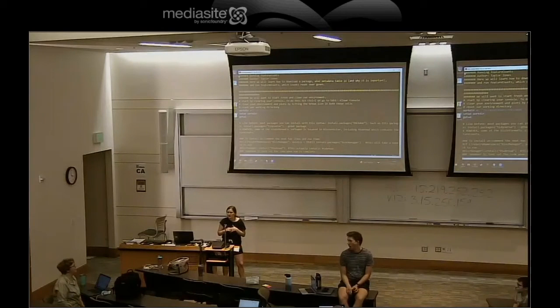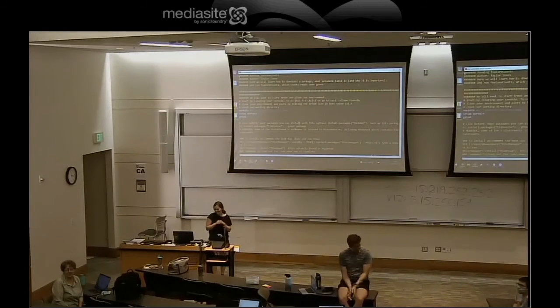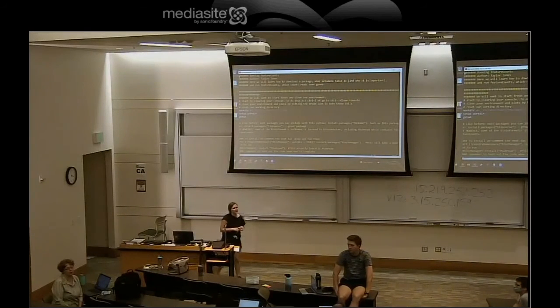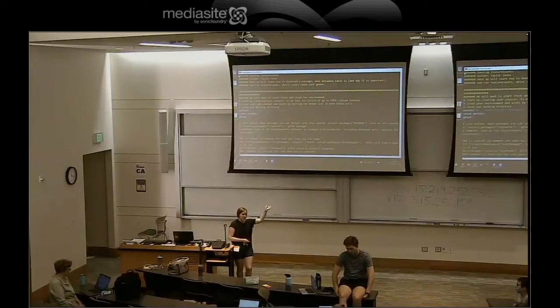There's no package on here right now. Local install is what you did, and if we all local installed on the supercomputer, we'd probably kill it. So instead, we're going to have the IT staff global install it, which means everybody in the room will be able to use it. It's like the other day when you did module load FastQC. We want to do that with Subread, which contains featureCounts, which is what we would be running.